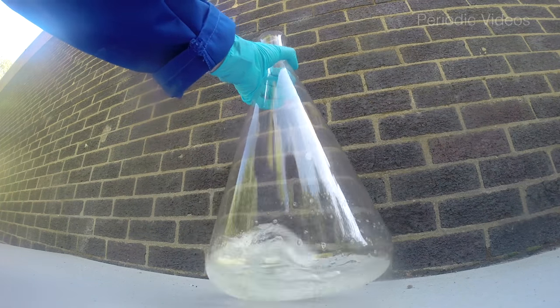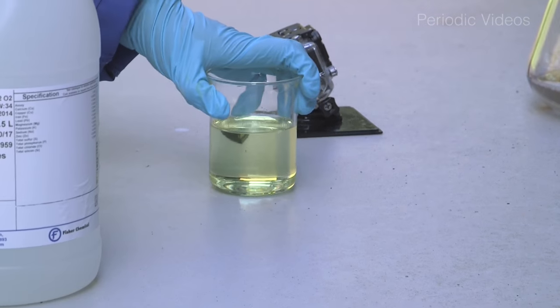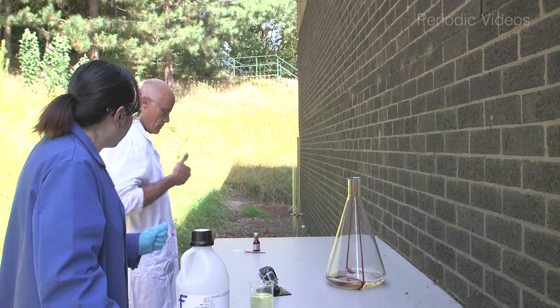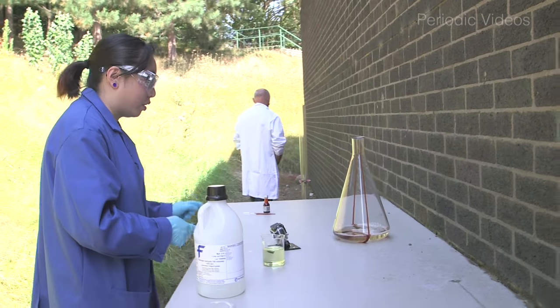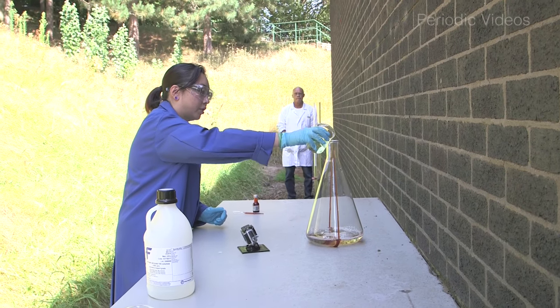The final ingredient to our reaction is a saturated solution of potassium iodide. So this is what's going to make this reaction go. At this point Neil, you need to move that way because I'm going to very rapidly be going that way as well once this has been added in. So are you ready? Three, two, one.